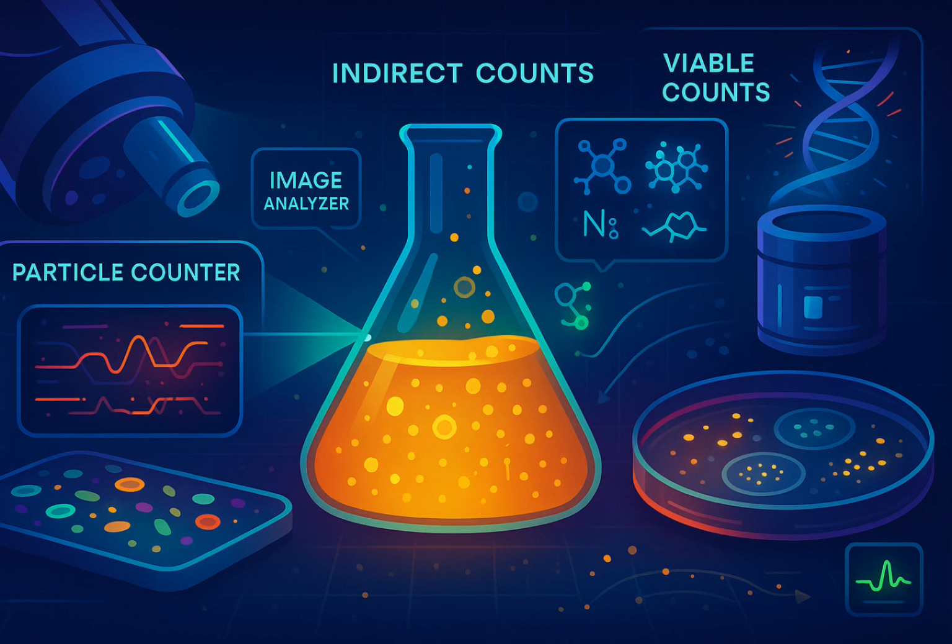And the size of that pulse is related to the size of the cell. The machine counts the pulses. Clever. And it can tell size, too. It can give you a size distribution, which is pretty useful. And it's fast. Thousands of particles per second. Very reproducible. Sounds great. Limitations.